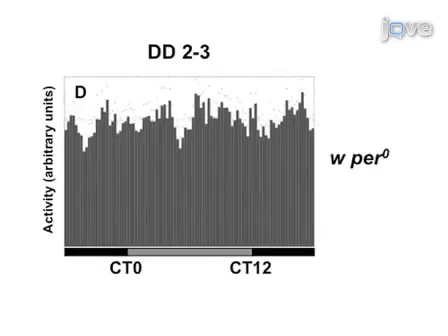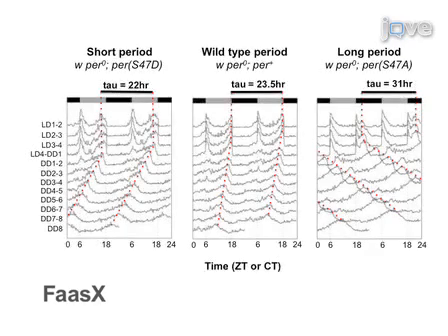Loss of behavioral rhythmicity is much more pronounced in DD and generally manifests into the total loss of morning or evening peaks of locomotor activity, as seen in per-zero flies. In addition to eduction graphs, locomotor activity data can be represented as a double plot actogram for each individual fly or fly genotype, where 2 days of data are plotted sequentially on each line, but the last day's profile begins the next line of 2 days' worth of activity.